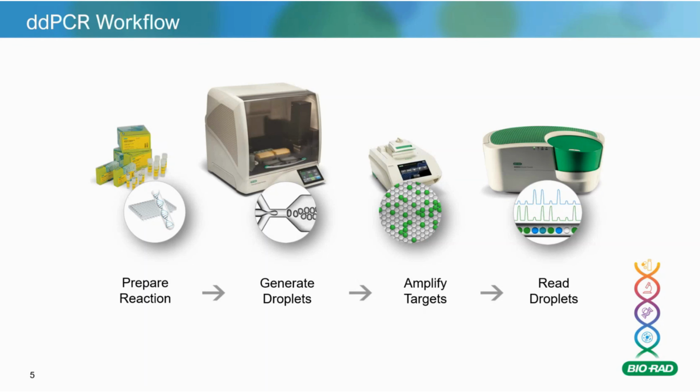In droplet digital PCR, it's like a flow cytometer. In a flow cytometer, you pick up your sample of interest, and your cells are each read by lasers one at a time, and they fluoresce or are excited, and then they return with another wavelength, but they're read in a single file one at a time. That is the same for ddPCR. So each well, all 20,000 droplets plus or minus, are read one at a time through a detector.